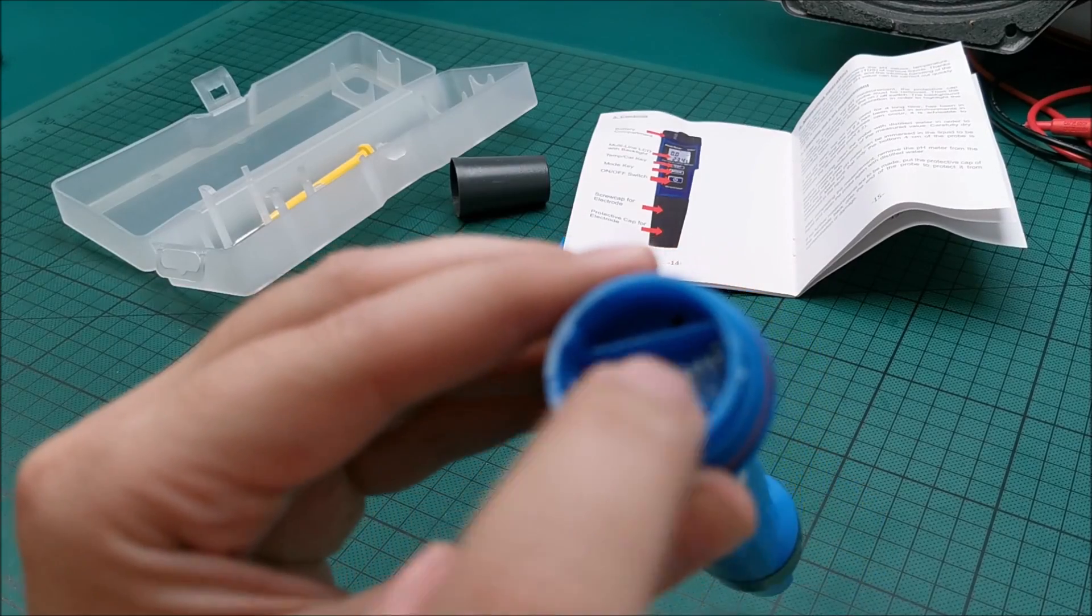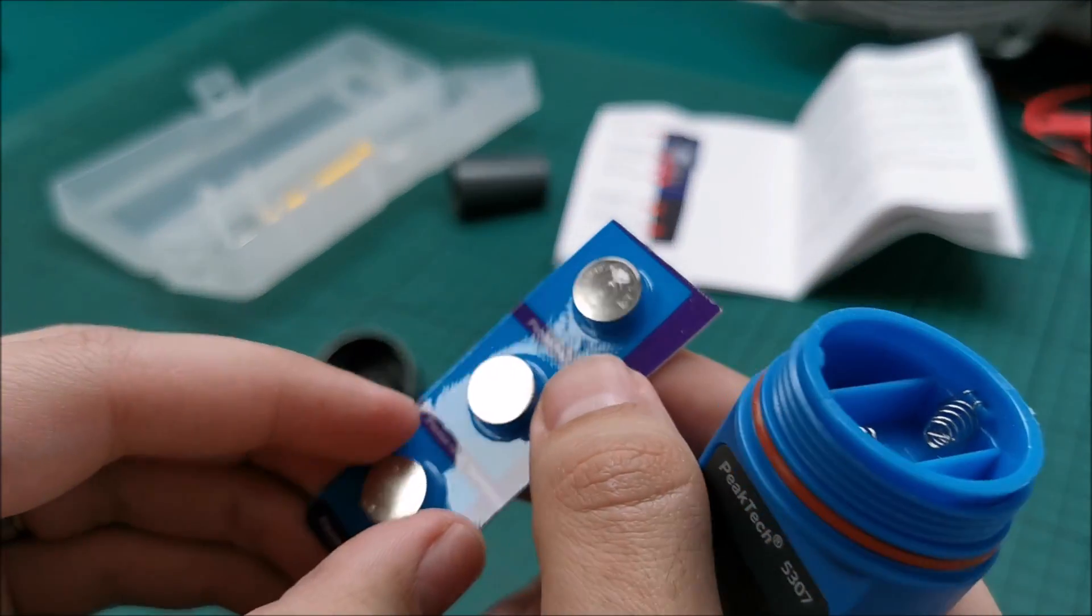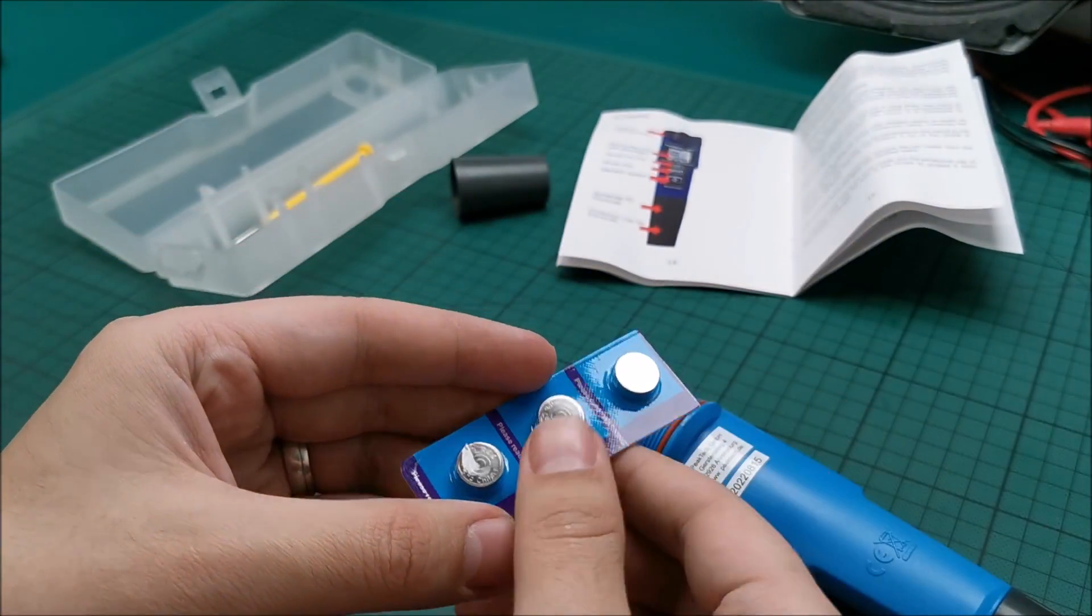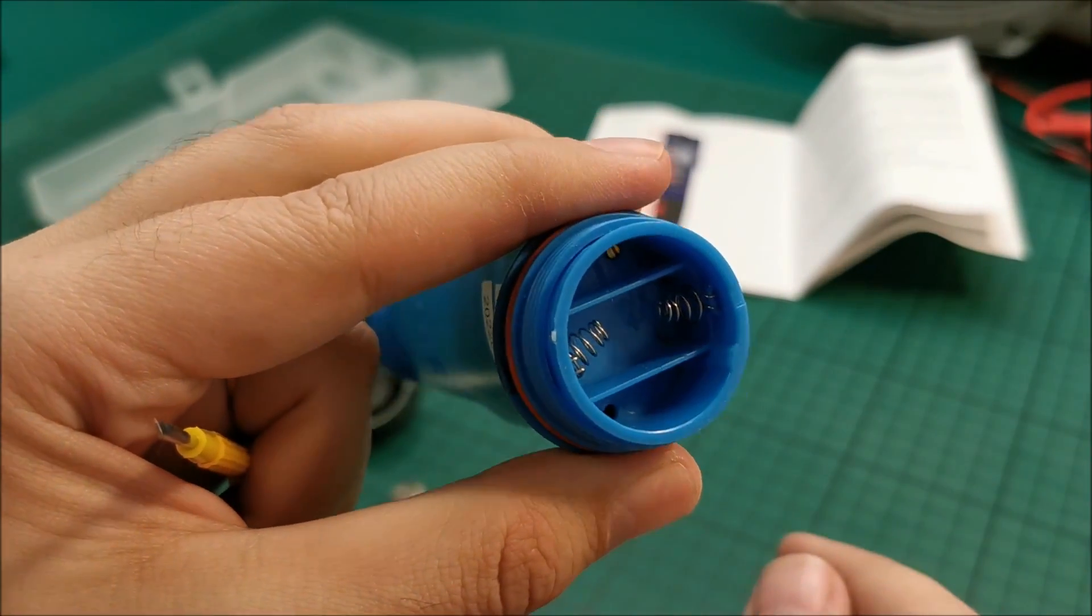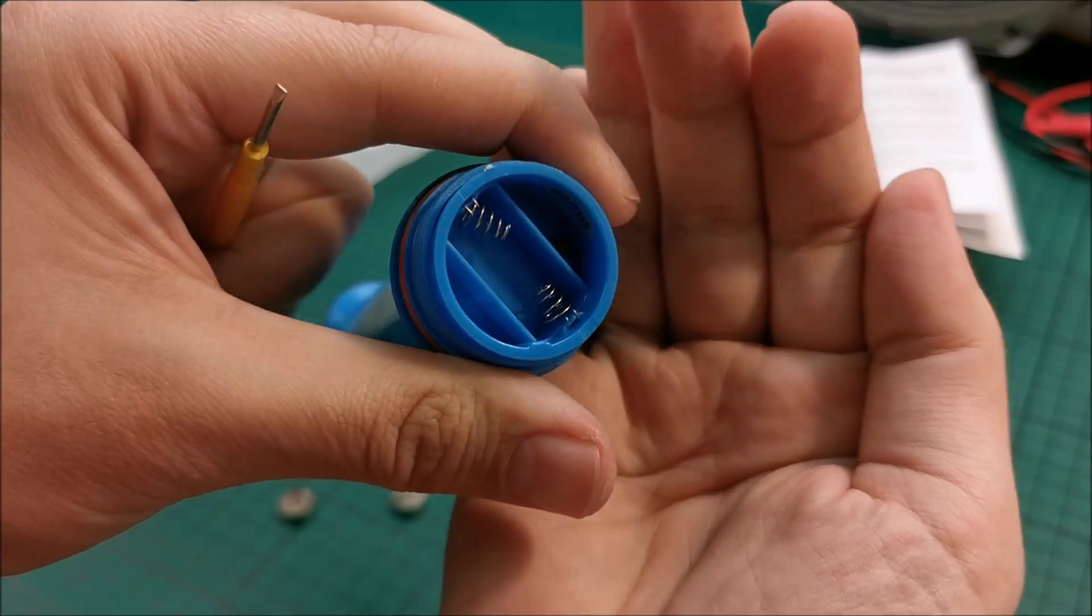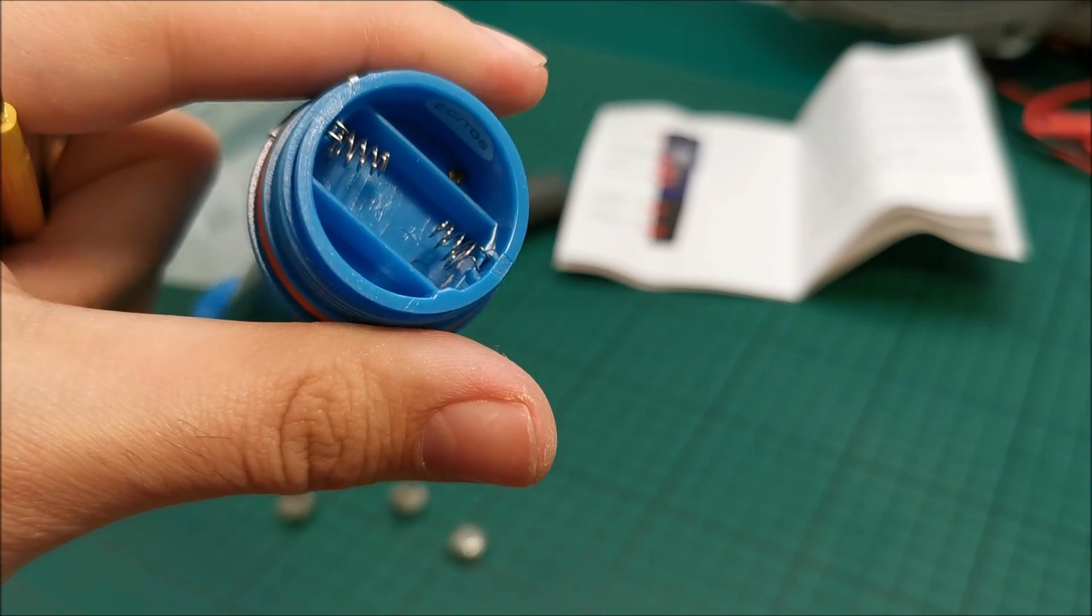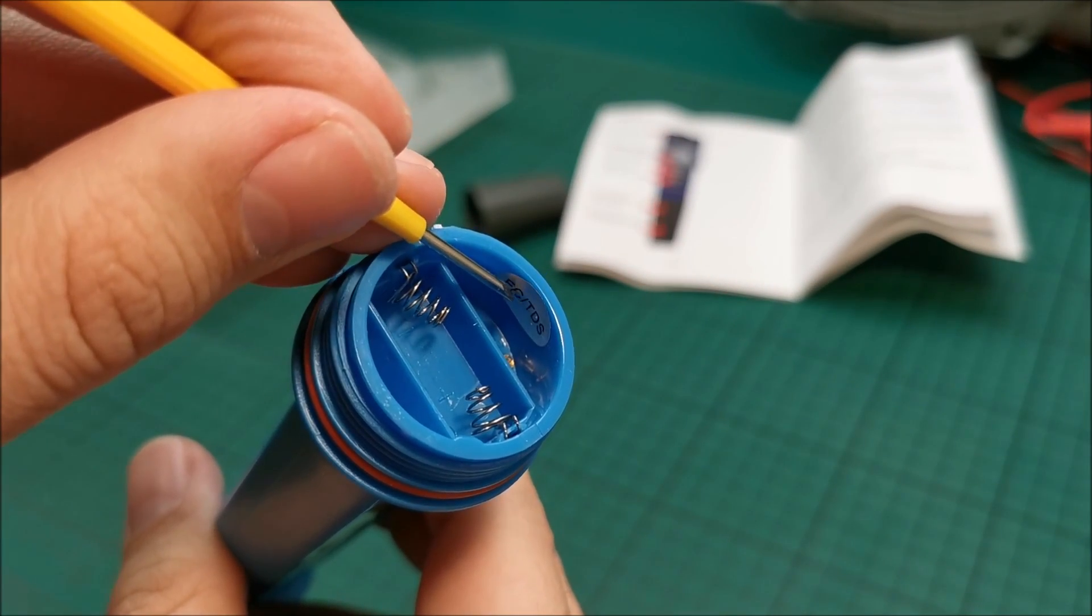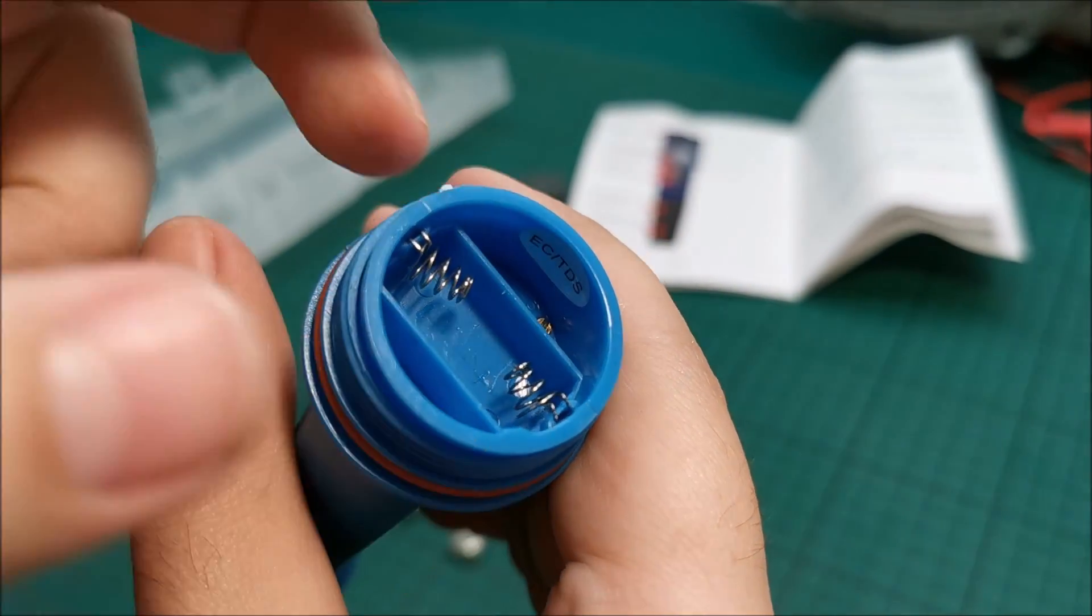We have the plus right in there on a side. So it means that all the positives will be going to that side. And for this type of batteries, the big metal part is positive and the tiny on the front which we will see later is negative. I spy with my little eye, let's make some more light in here. You see that screw right? Ah, let's see this light that I intentionally made adjustable. You can see that screw right there. Easy TDS. To change between them or to adjust something, not really sure yet, but for that we have the little screwdriver.